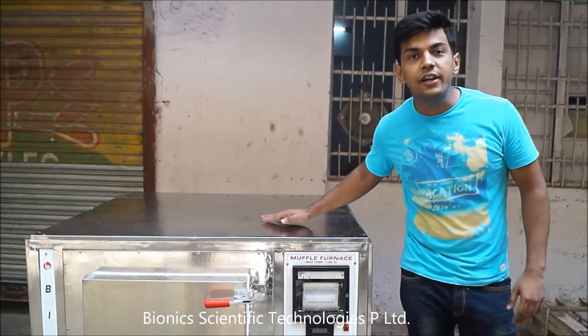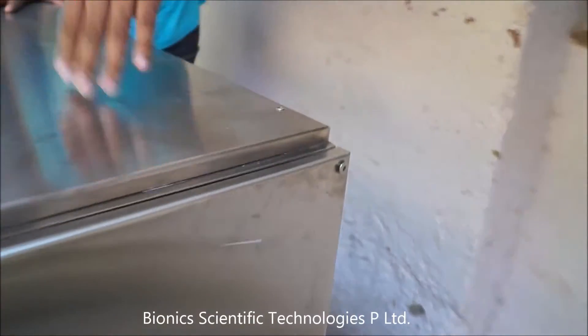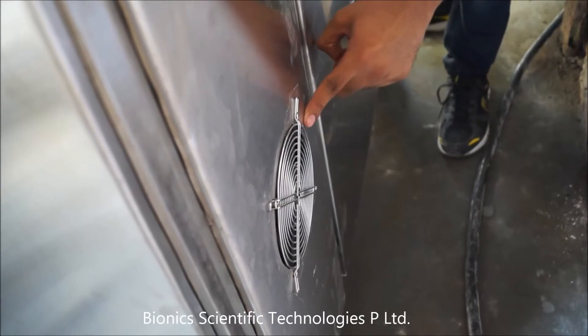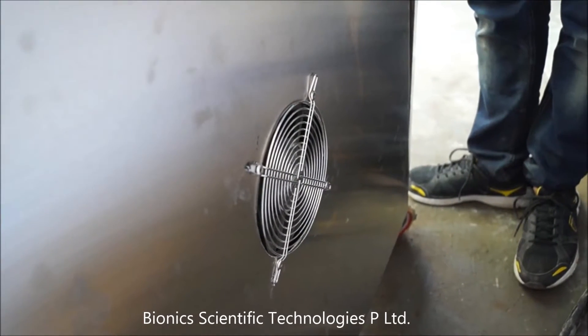The furnace is fitted with 2 cooling fans. One cooling fan eliminates the heat of the control panel, and the other cooling fan removes the heat of the Muffle Furnace.